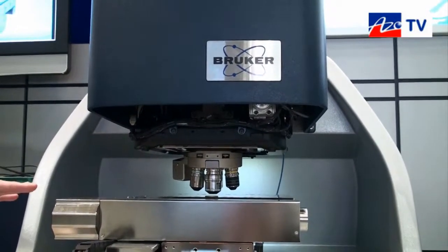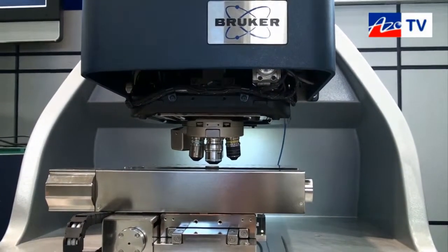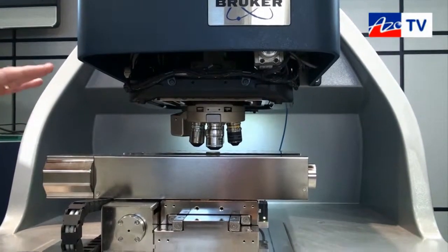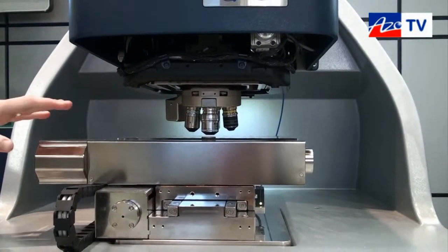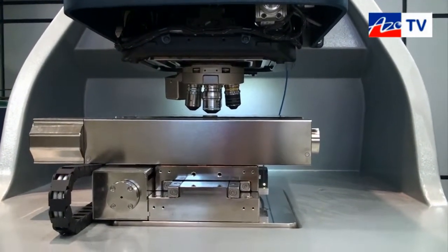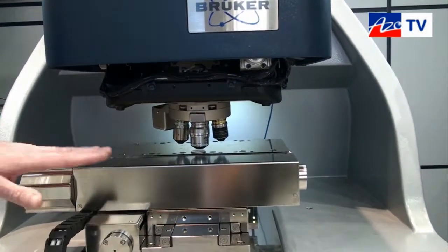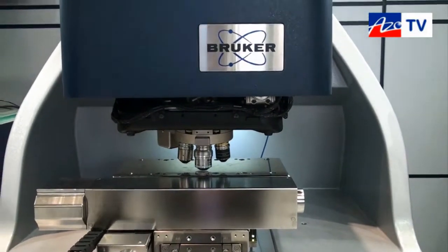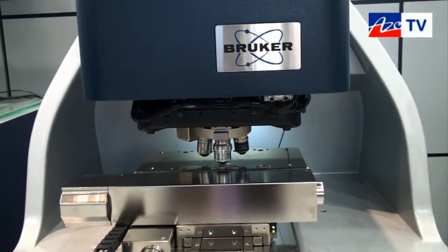The measurement time is typically very fast and the measurement speed is independent of the XY lateral size — it's purely a function of how far the objective has to move. In Z we can accommodate up to 10 millimeters. Laterally, the largest field of view is on the order of 4.5 millimeters and the smallest is on the order of about 30 microns.